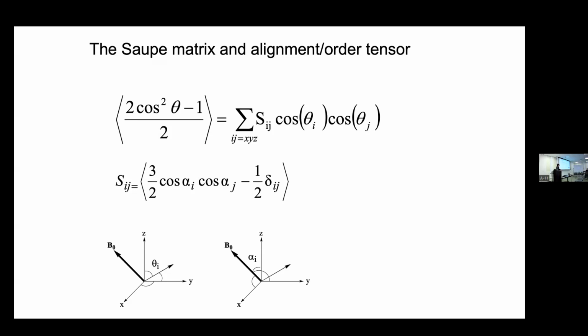What in a nucleic acid has low CSA? What carbon? Does phosphorus have a big or small CSA? Huge CSA. Forget the phosphorus. Sugar. You guys also have C alpha and C beta, right? C alpha aliphatic carbons have small CSAs, so that's where I would do the comparison. The base carbons, on the other hand, the RCSA contribution can be as big as the RDC. So they have sizable CSAs. But yes, you definitely want to make sure.